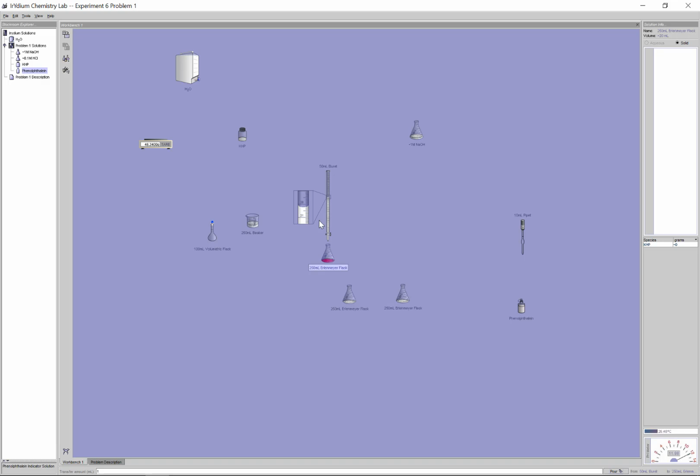Alright, so that gives you an approximate here. If I do the difference between the 20.21 and 11.21 here, it's roughly about 9 milliliters. Again, that one there was just to give you an approximate here.